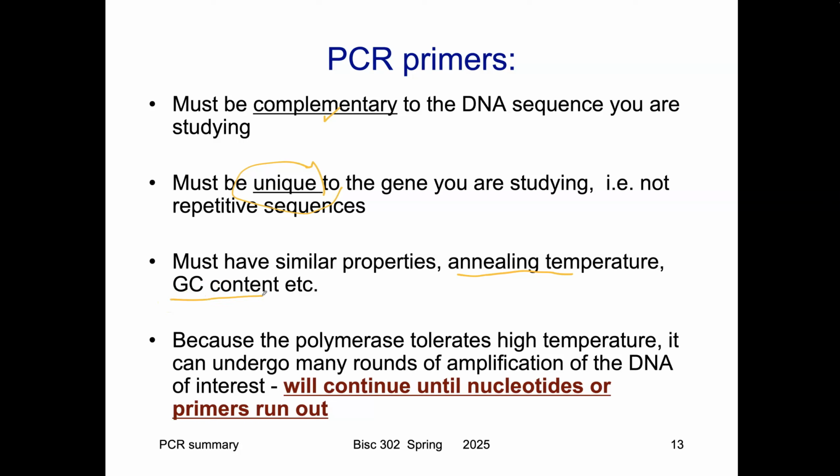The idea is there is an annealing temperature that allows your primer to find and bind to your DNA with maximum accuracy. So it will only bind to the correct sequence and not to one that's similar but has a few places where the nucleotides don't match. And so this is really important for making sure that the primers are only binding the intended target.